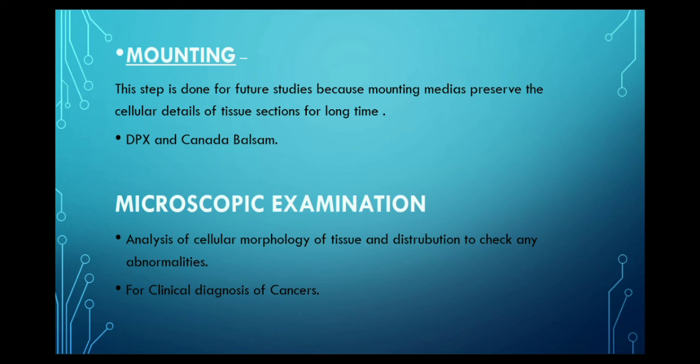This is all about mounting. Then the last step is microscopy. Now tissue sections are ready for microscopy to diagnose any abnormalities or for clinical diagnosis of cancers. So these were the steps which should be followed for routine histopathology examination.